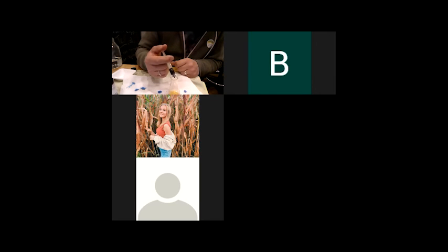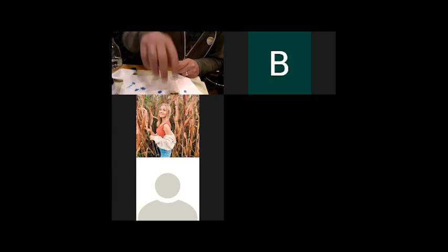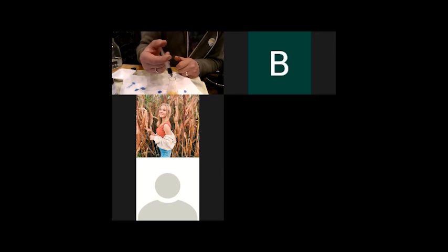And if I went over, then I'll need more than 5 mils. There we go. Yeah. Oh man. Just did disappear again. So I think I'm about 1 or 2 drops. Yep, goes back to yellow again.